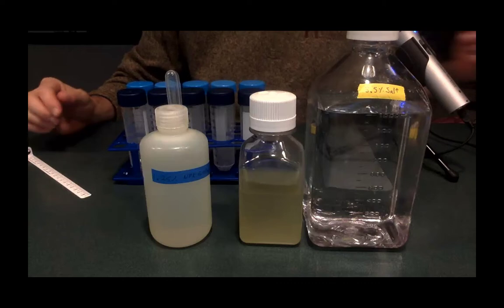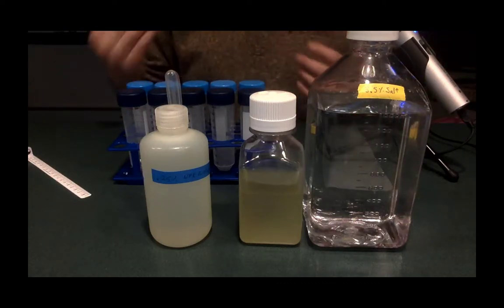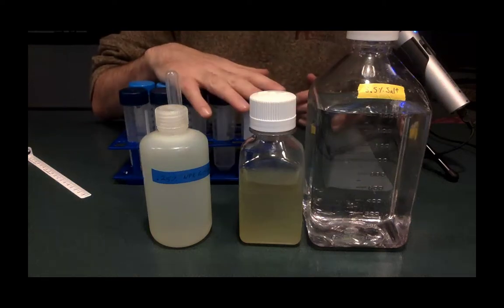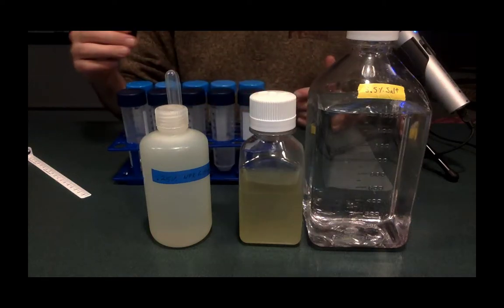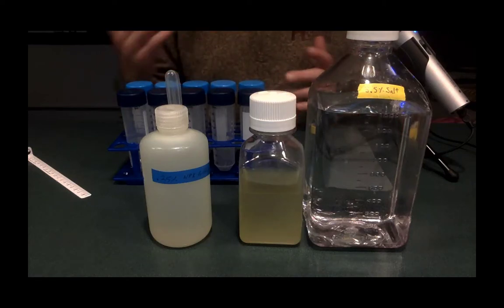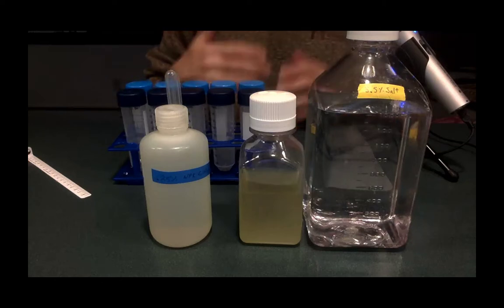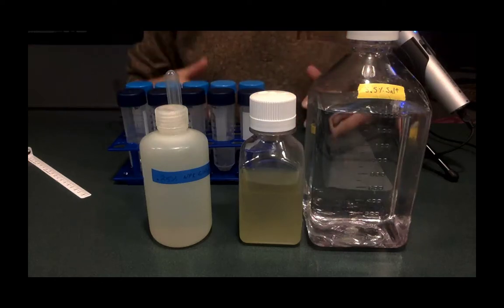All right, so I'm not going to tell you exactly how to do setup, but I am actually going to set up an experimental tube. But you're going to want to take your rack of tubes and set it up so that you've got at least one type of negative control. I'm not going to tell you how to do that. You should check with your teacher about that. Also, I'm going to set up one positive control. Again, not going to explain it. And then my experimental tube.